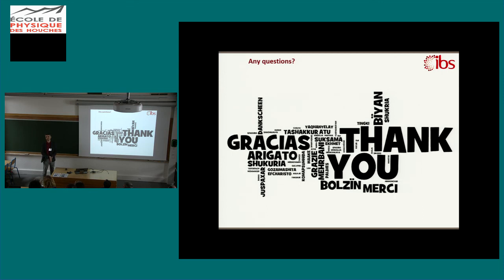Maybe also a question which is not so easy to answer. If somebody has a recommendation, maybe you. I was just wondering if you have a recommendation for people who want to design and test fluorophores which are actually photoactivatable, so you can't probe the fluorescence along all these steps to measure, I don't know, folding efficiency, etc., because the first state would be dark.